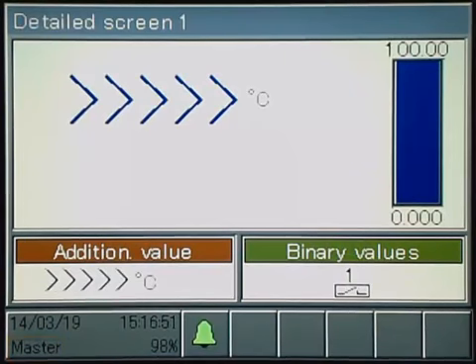The system is configured after the logon with this user ID. In the Aquis Touch S, the redox combination electrode is connected to analysis input 1. This is designated redox potential.